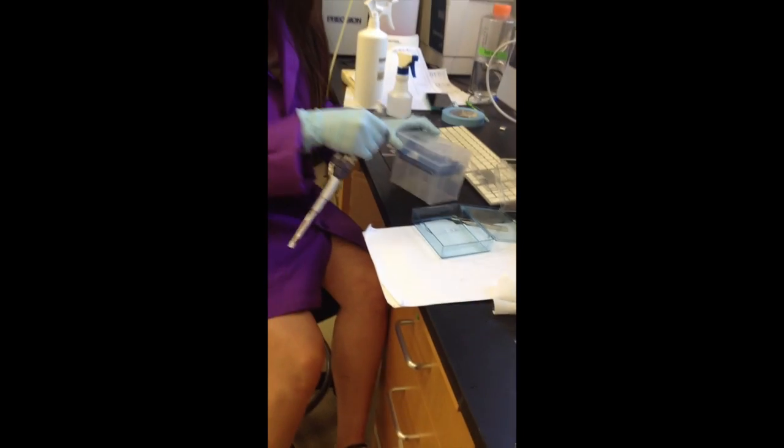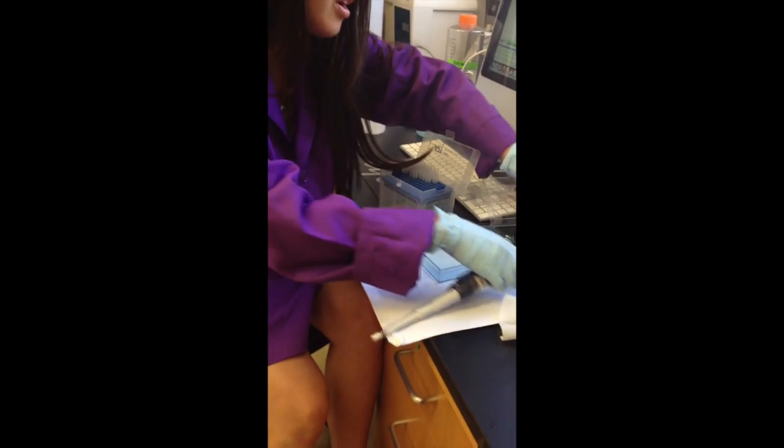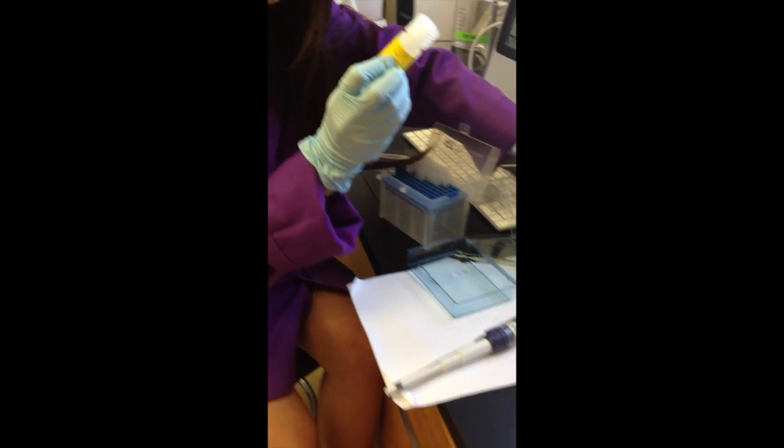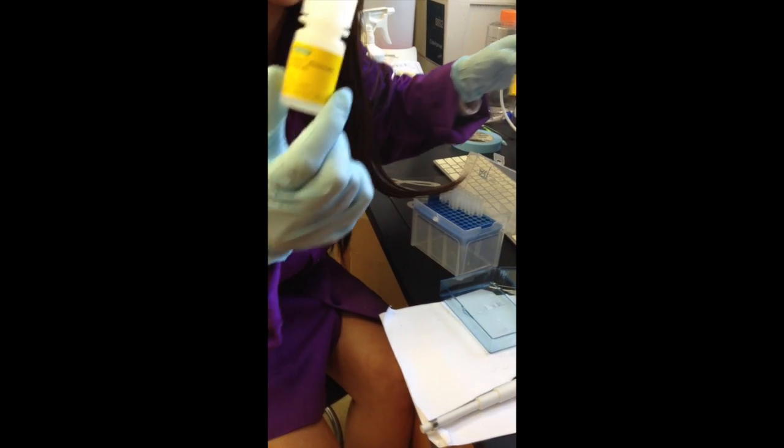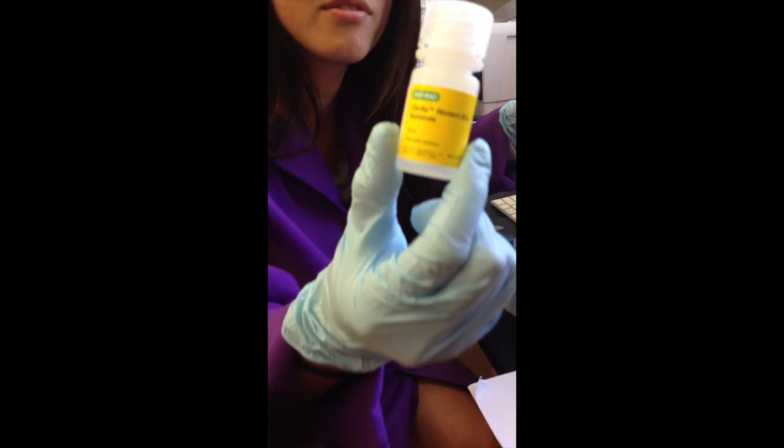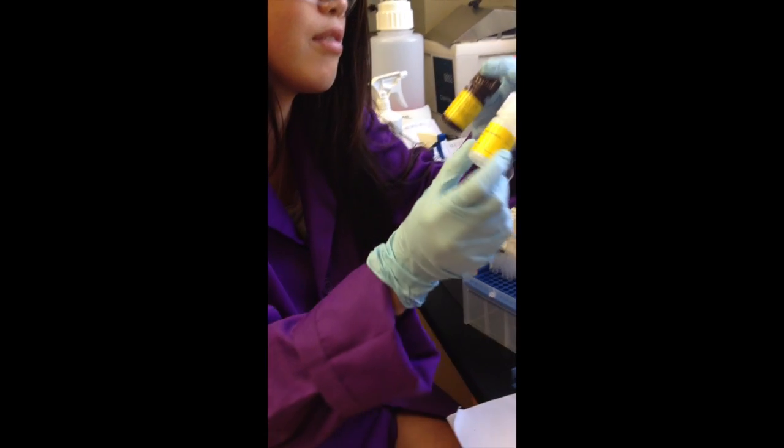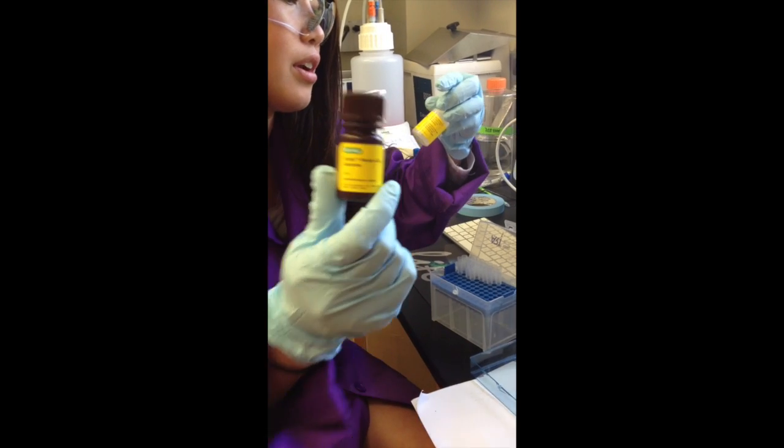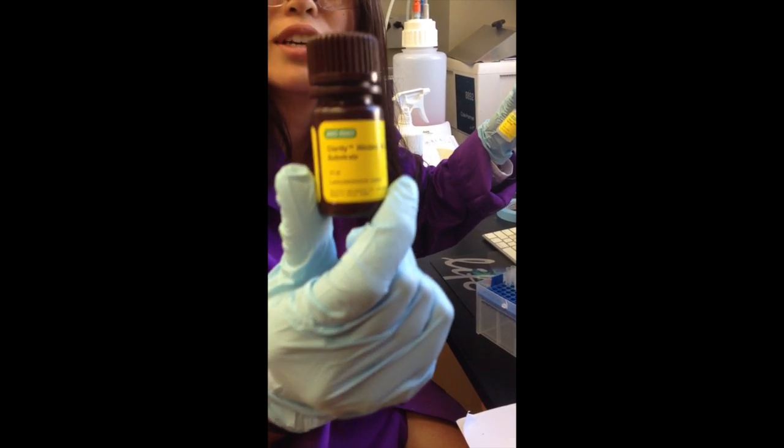Once you're done, make sure you cap the pen to prevent it from drying. Now we will pipette in the substrate, and we are using the Clarity Western ECL substrate from Bio-Rad and the other Clarity Western ECL substrate.